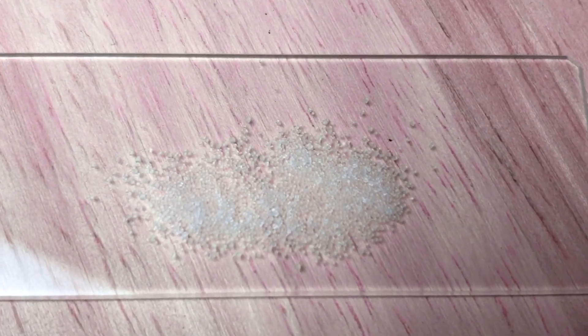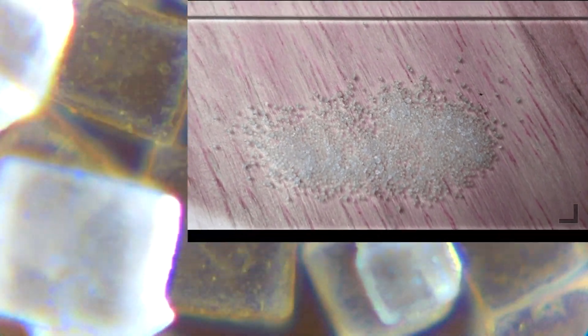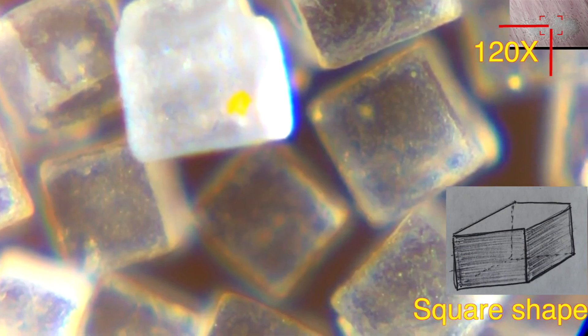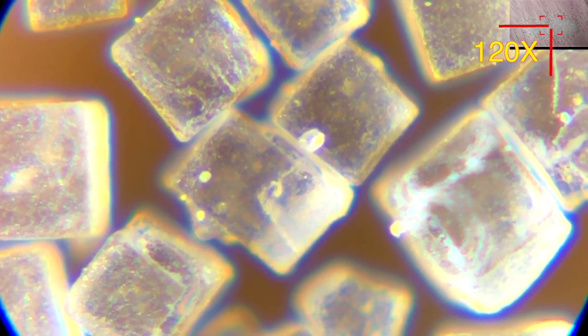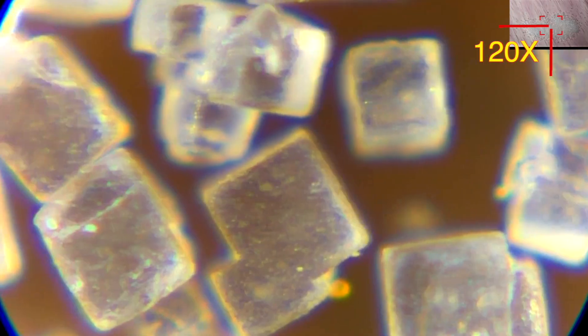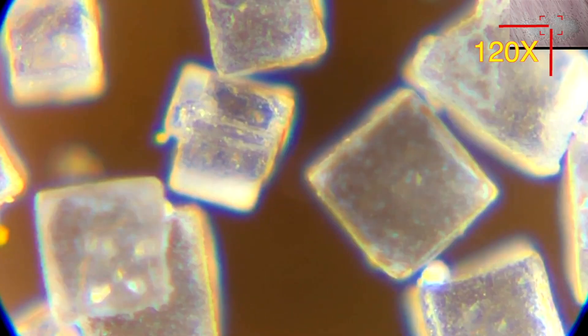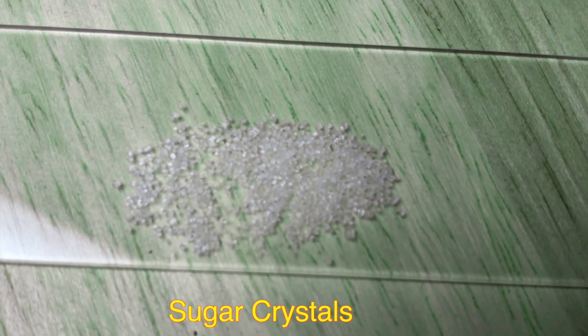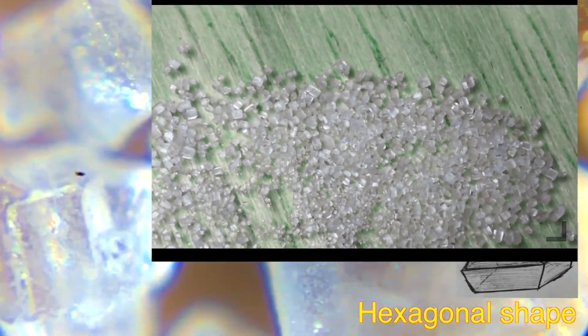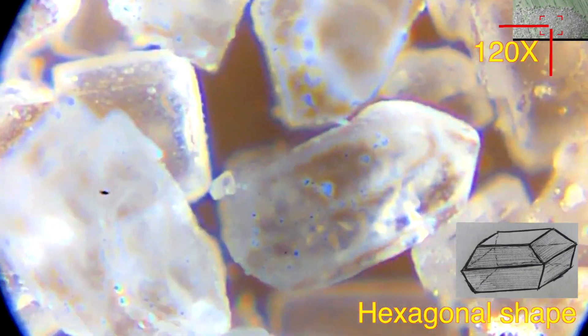Let's look at salt crystals — you can see they are pretty square in shape. And these are sugar crystals; looking under the microscope, we can see they are in a hexagonal shape.